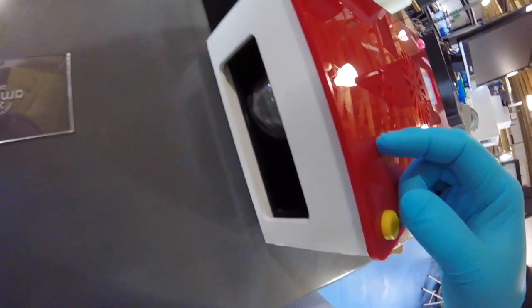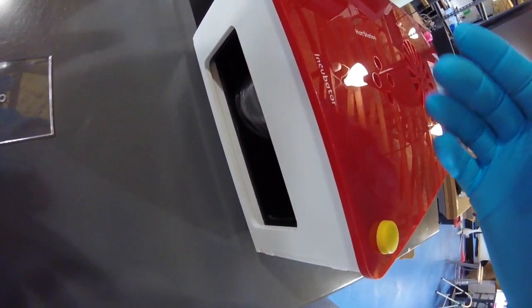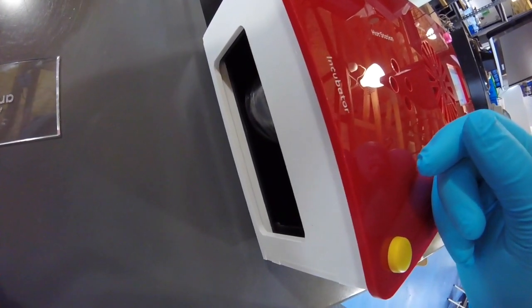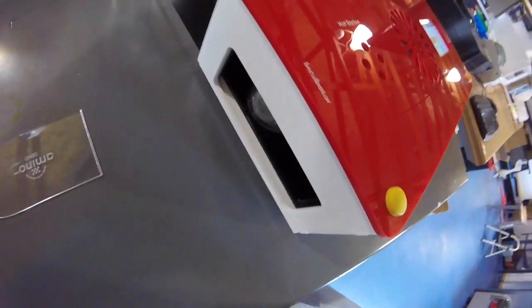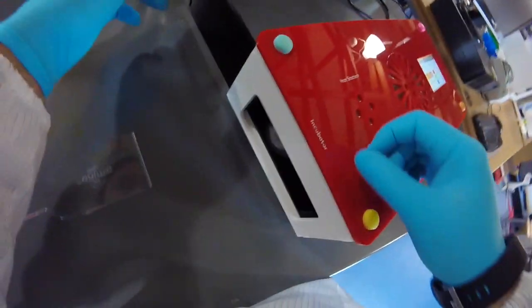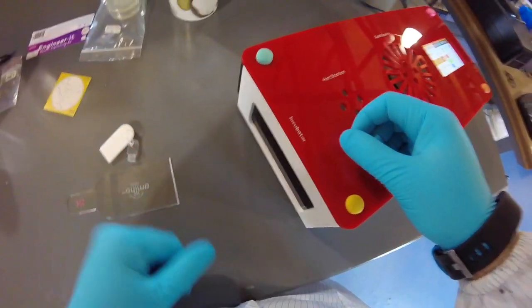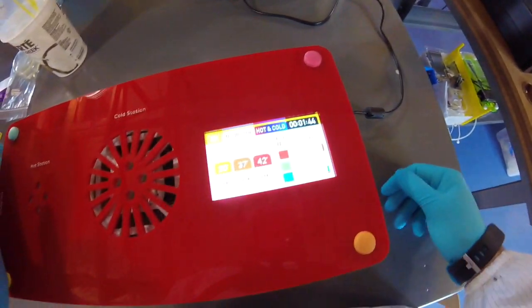And each of these playgrounds comes with 4 humidity chambers because you can fit 4 stacks or 8 plates. If you don't need all of them, just remove them, okay, and then only use what you need, and you can put all the other humidity chambers in a little container somewhere else. Okay, so that's really it. I'm going to close that. I'm going to lock it, and I've started my timer already.